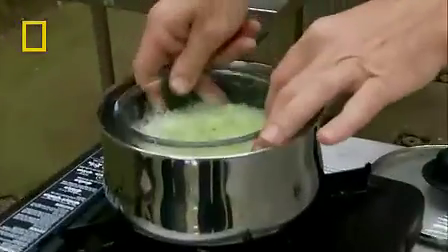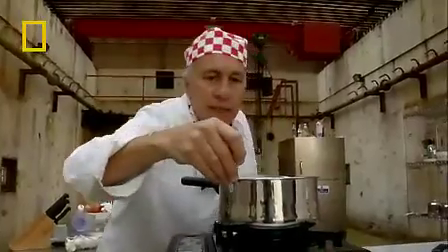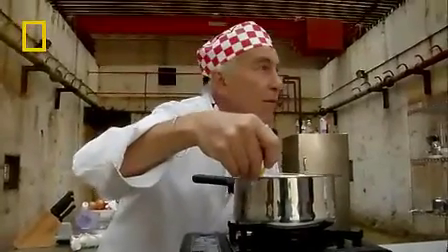And then we'll drop it in here. It's just at 50, so let's take it up to 60 Celsius. And we leave that just simmering away for about 15 minutes.